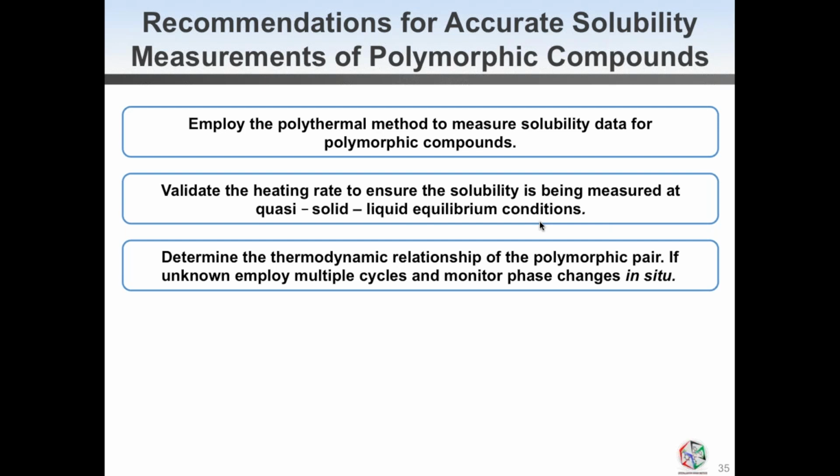Then we can use this type of measurement with heating and cooling cycles to actually determine the thermodynamic relationship of a system we might not know, but also to confirm the thermodynamic relationship of a stable and a metastable form.